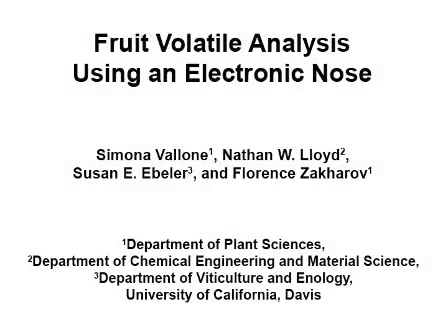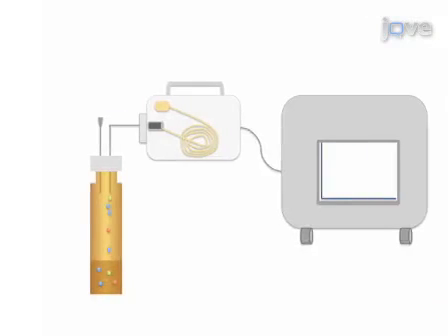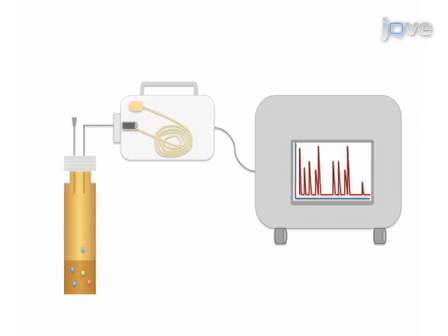The overall goal of this procedure is to perform a rapid analysis of volatile compounds in fruits. This is accomplished by first cutting and homogenizing the fruit tissue. The vapor phase above the liquid sample is then analyzed with the electronic nose.